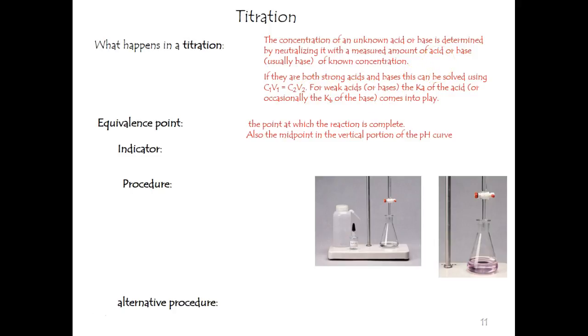In other words, I'm sorry, if you had to add a lot of, let's say, 1 molar solution of sodium hydroxide to that unknown concentration of acid, which you do know the volume of, after all, you're dripping it into a known volume of it, then you're solving for one of these 4 and you're given the other 3. And if it takes a lot, you'd be saying to yourself, wow, strong acid, right? Took a lot of my base to neutralize it. So hopefully you get a feel for the logic behind titration.